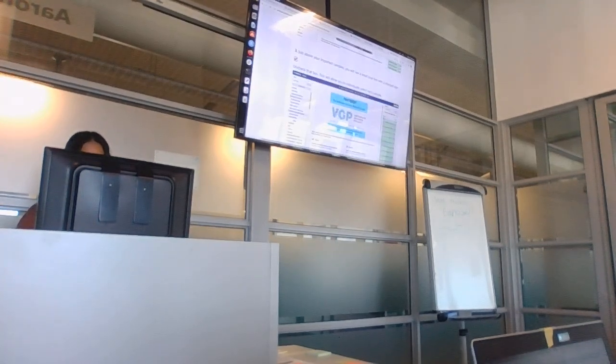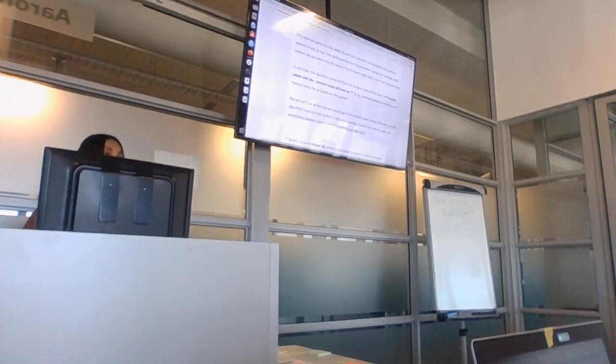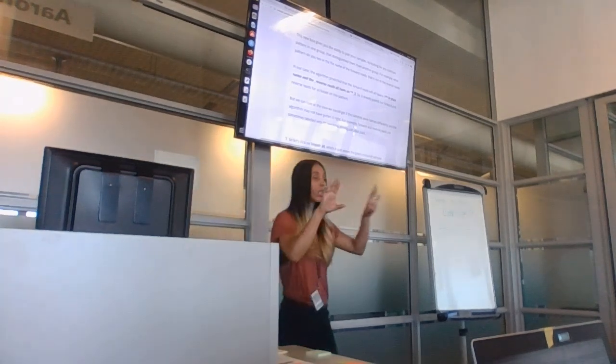So when you unclick this, you click on select all here. On the side, there will be a drop down. Okay. Then yours should be automatically paired.